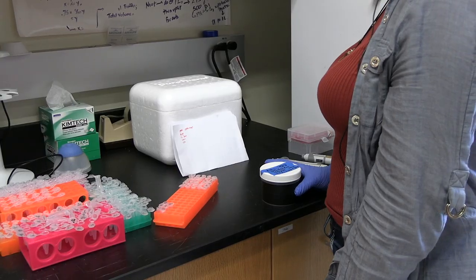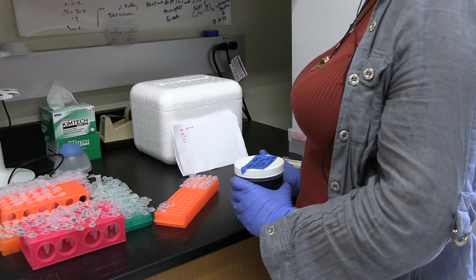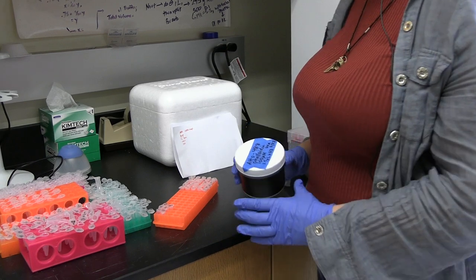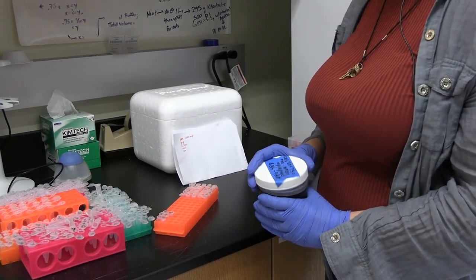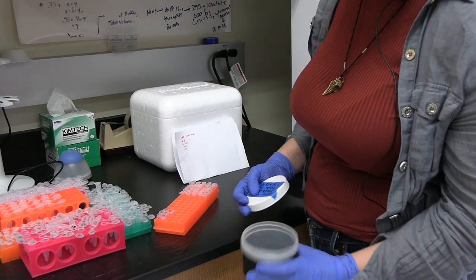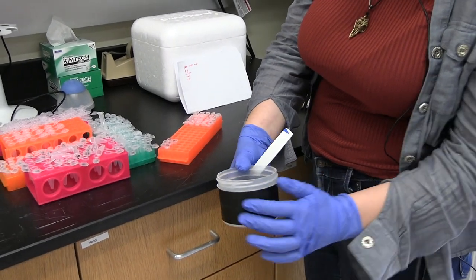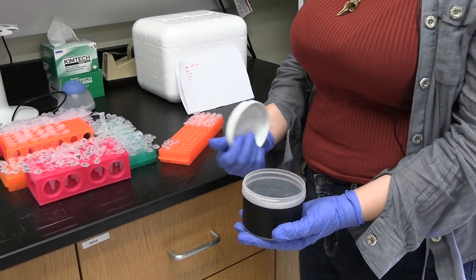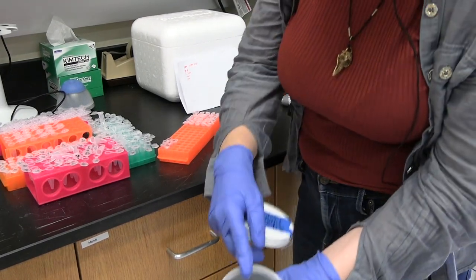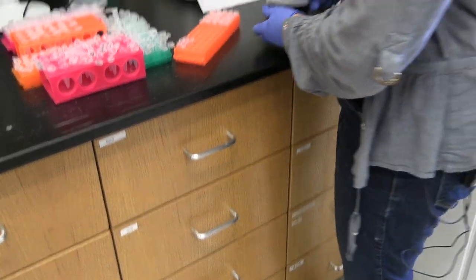Okay. Cool. All right. Another cool fact about DMSO, other than the fact that it absorbs really quickly into your skin, is that it needs to be kept separate from water. So we store our phalloidin, aliquoted in DMSO, in desiccant. And I just put in a little bit of desiccant into this container. I also put tape around this container to keep it nice and dark so our fluorophores don't just get damaged from like the light that would go into the fridge day to day. A little bit of indicator, that's the little purple things. About this much should do.